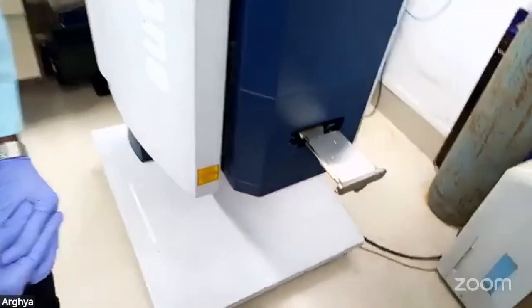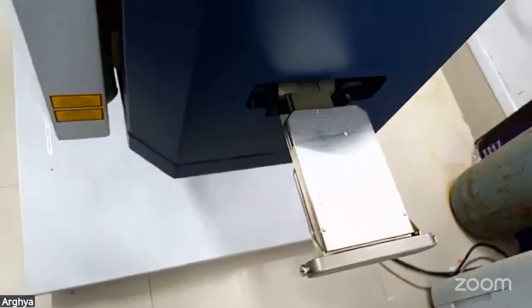So one thing I'd like to emphasize is that in this particular setup, what you see in the MALDI, you are actually talking about a 384-type plate, which is a large number of samples you can actually place. So if our goal was to look at hundreds of spots and you want to identify them, the very first thing you'd like to do, I think MALDI could be a very robust approach, because as you've seen in the plate, you can place all those large number of spots and then do that type of analysis on that. Right now what we are showing you here is essentially how to place that plate inside the MALDI. So you can go to the next one.